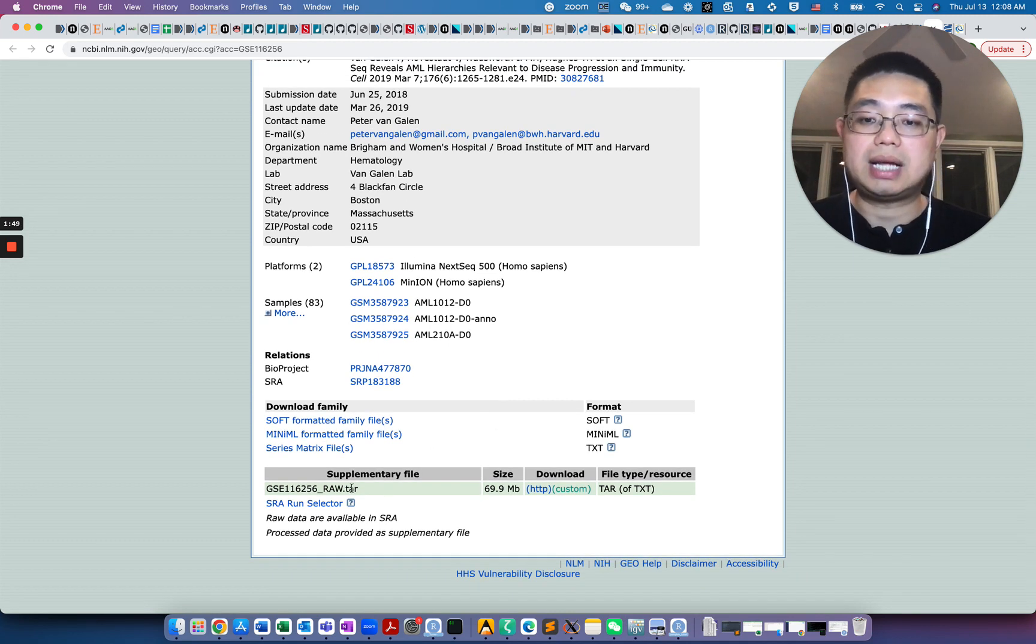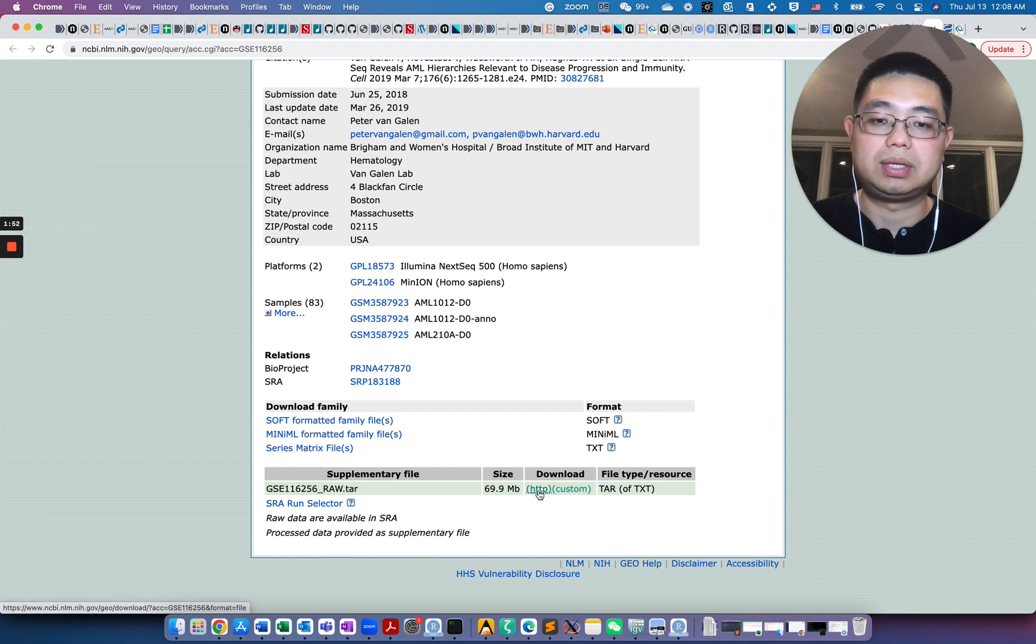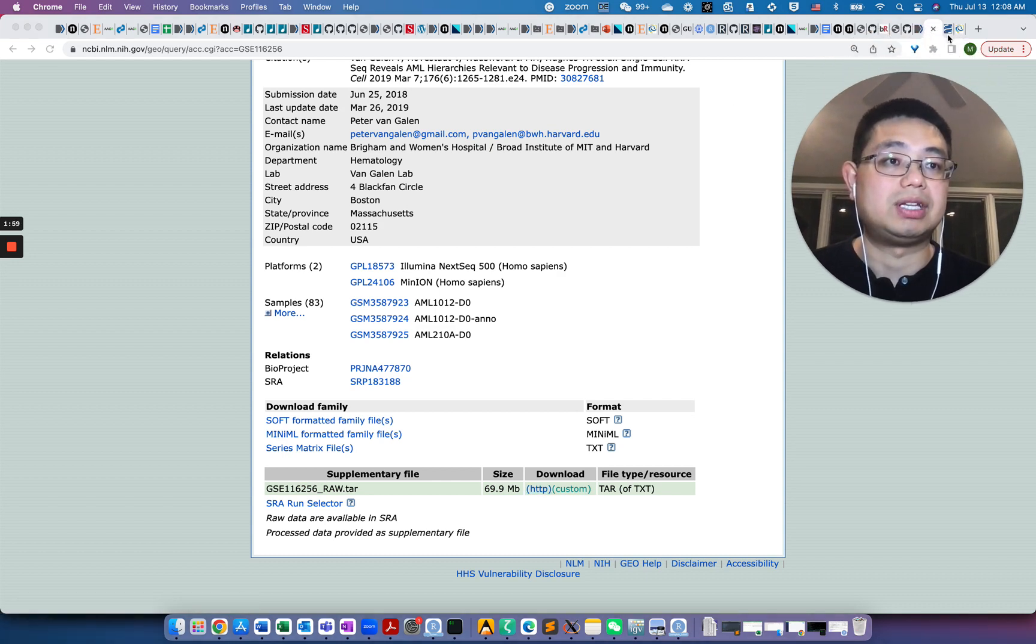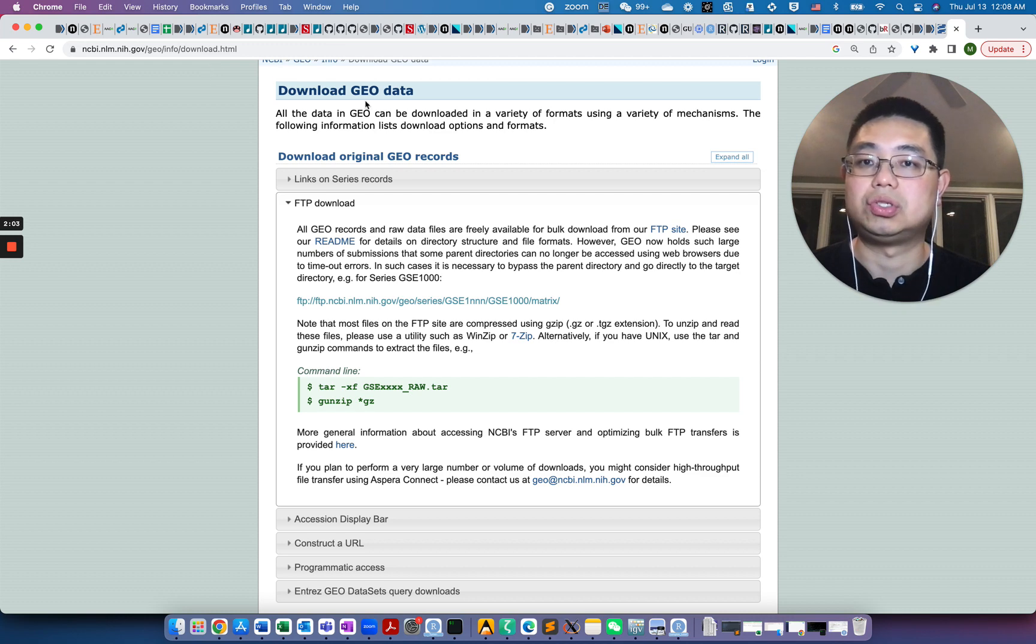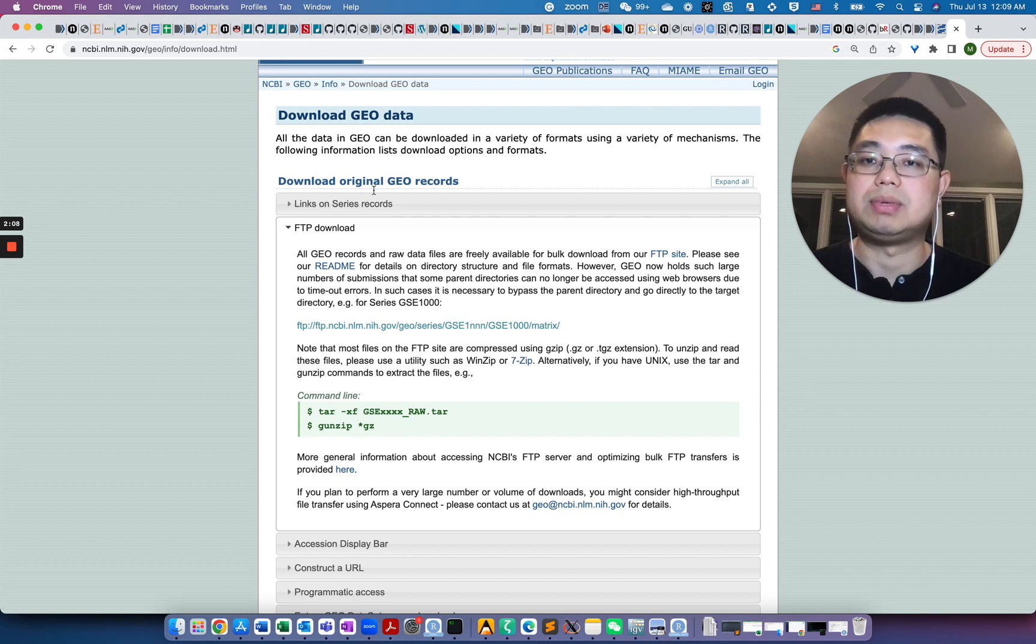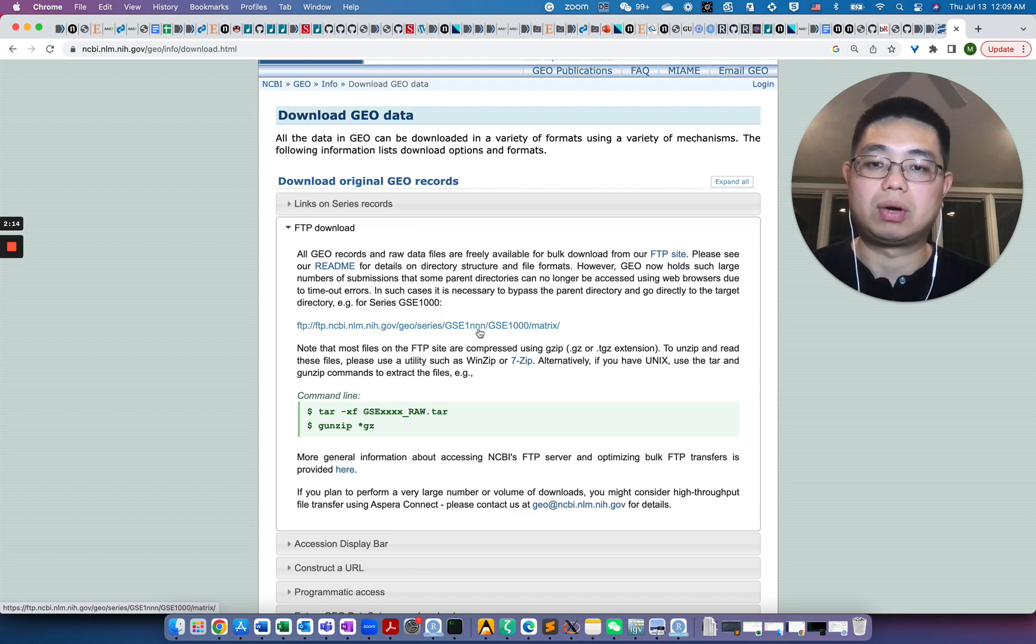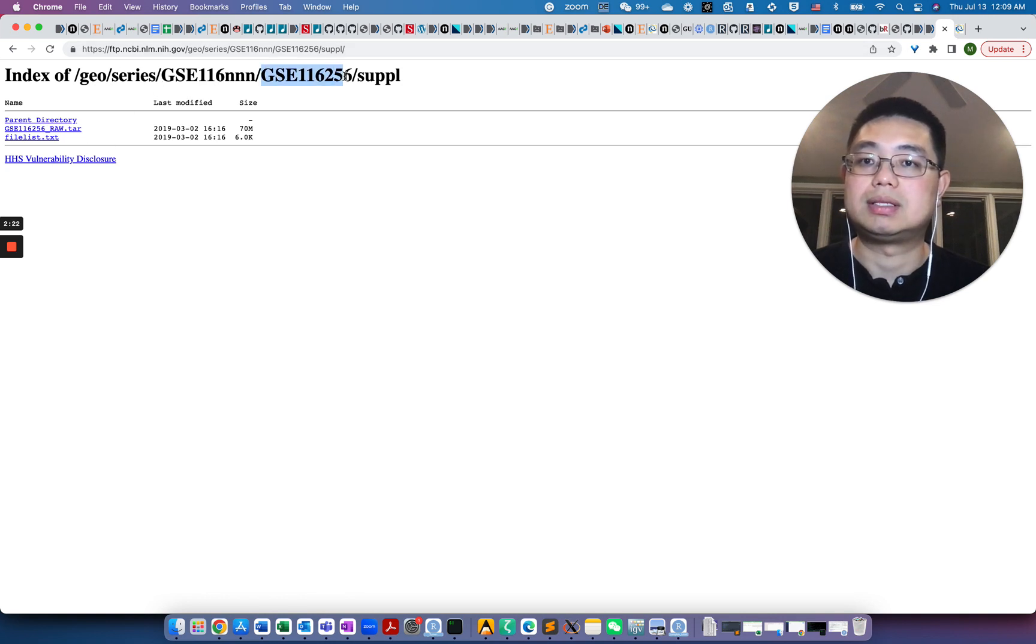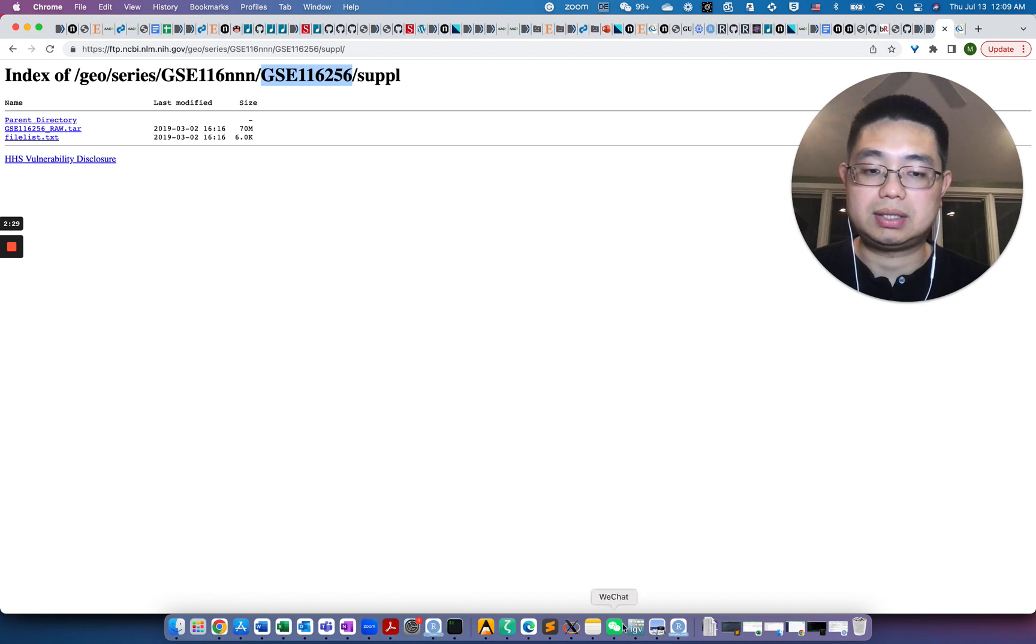It depends on how the authors upload their data. For this example, we have one sample, one data matrix for each sample, but maybe another GSE accession number, the author uploads all the merged data matrices together. In that case, it's very easy because it's a single data matrix. To download this, you can directly click here, but in order to do it on the command line, we will download it from the FTP. If you go to this GEO FTP, you'll find this page and it'll tell you where those GSE datasets are located.